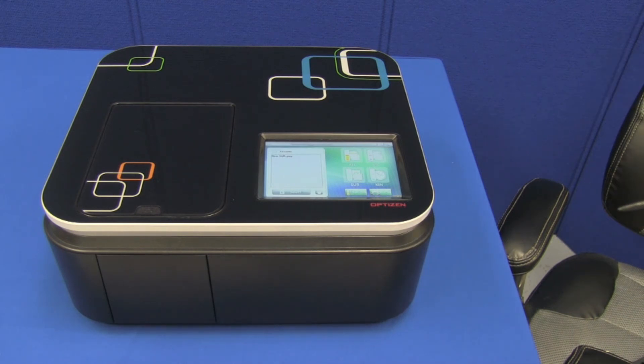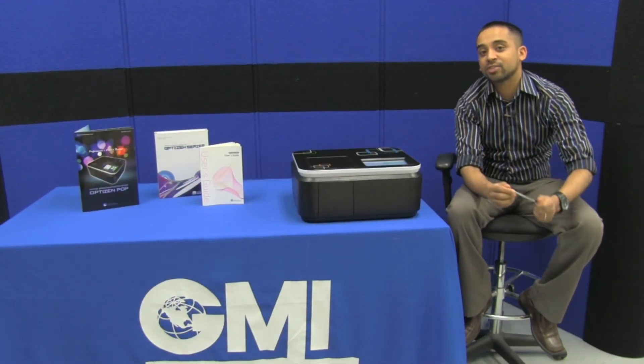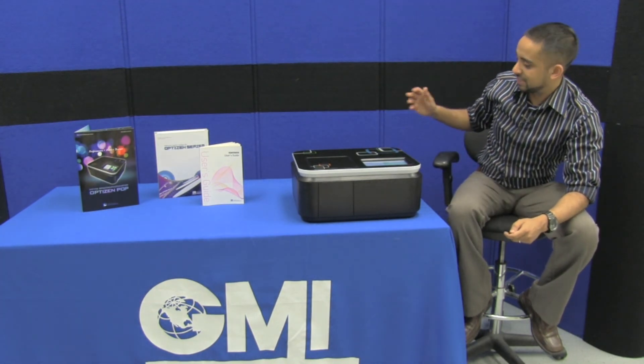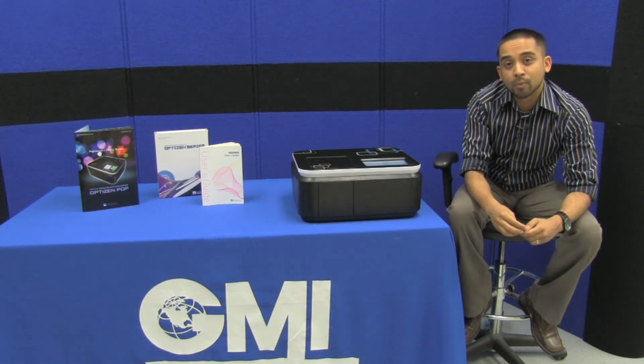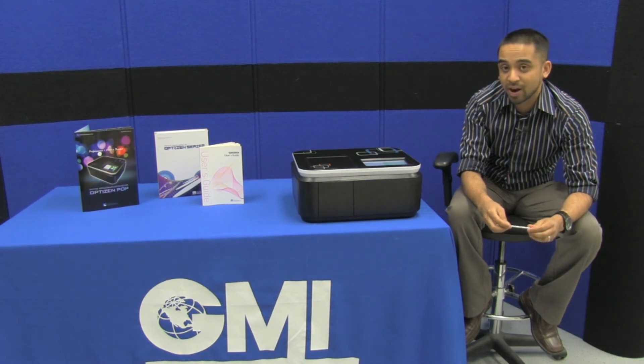The moving parts are fully quartz covered to protect them during operation. The makers of the Optizen Pop clearly invested a lot of time and effort into creating this very modern, sleekly designed, smart instrument. With industry-grade features at a very economical price, it really is a quite nice instrument.